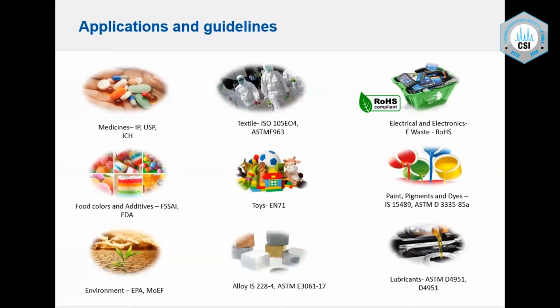You know that there are national and international regulations available to ensure the quality of different materials and different products. In those guidelines, they have mentioned the permissible limit, and they also mention the methodology, the technology you can use to analyze those elemental impurities for the quality of the product. All are defined in different guidelines, which we have shown in this slide.